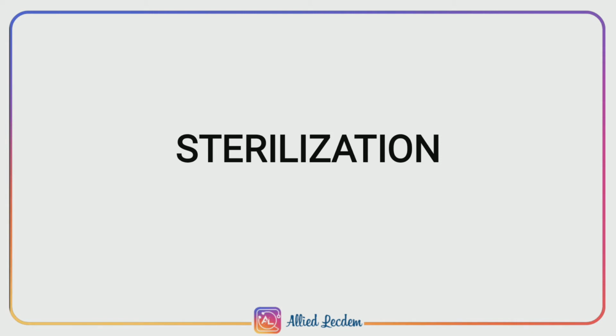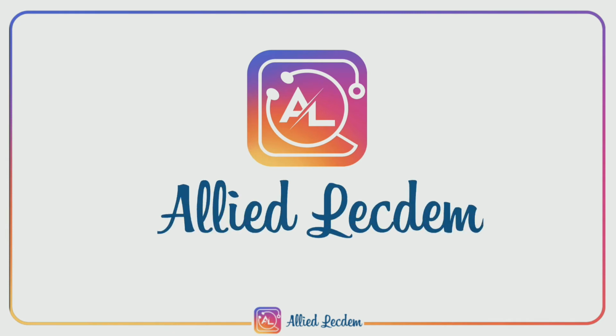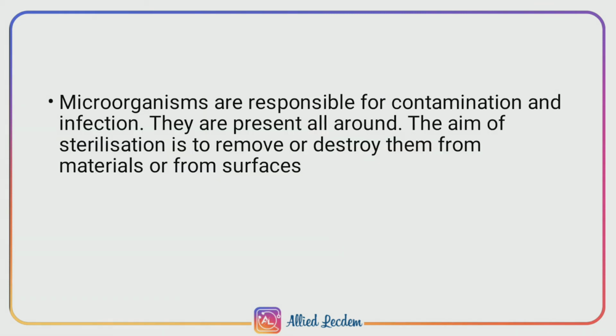Today's topic is about sterilization. Sterilization is nothing but a method which involves removing or destroying microorganisms which are responsible for contamination and infection, and they can be present in any surfaces or at any materials.